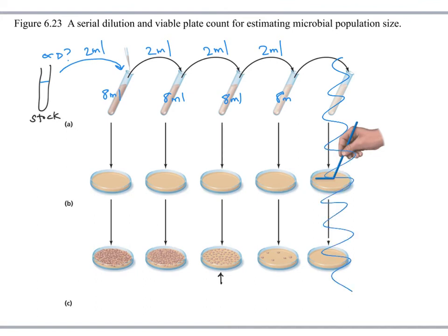And then of the dilution that's made, you're going to take out 3 mils to plate it. And then let's pretend these two are too numerous to count. This plate is 296, and here we count 11 colonies.